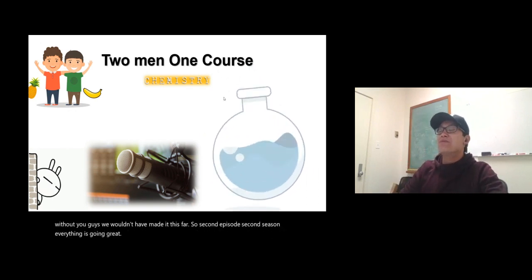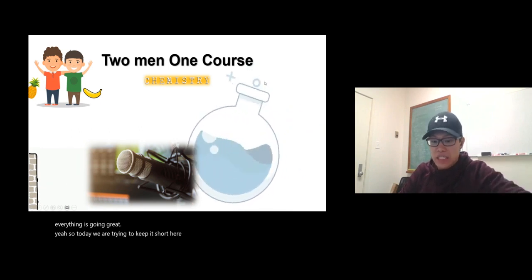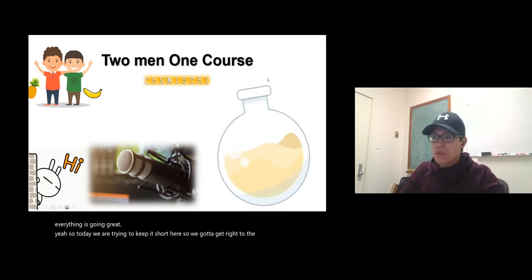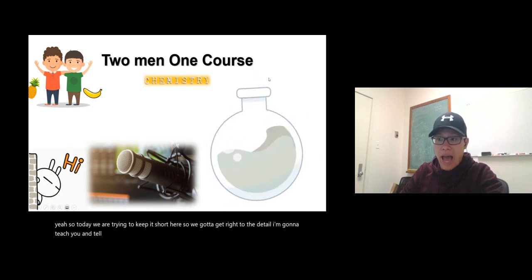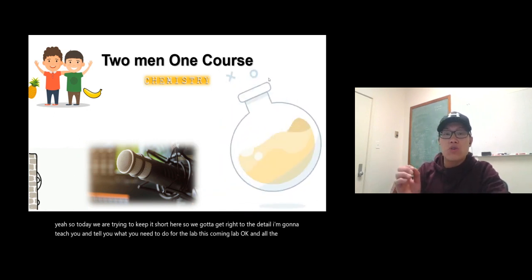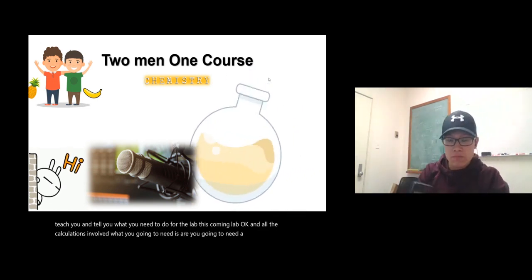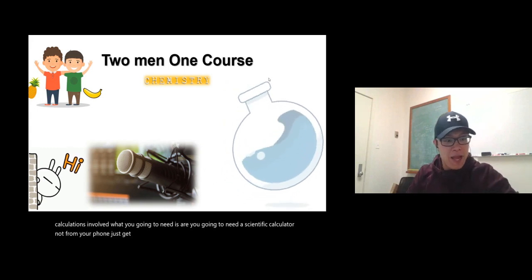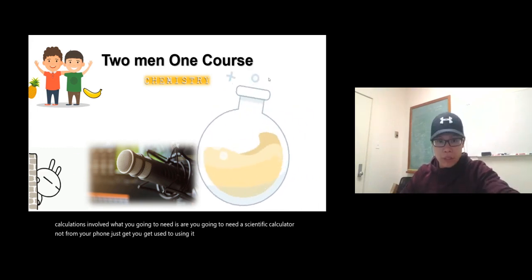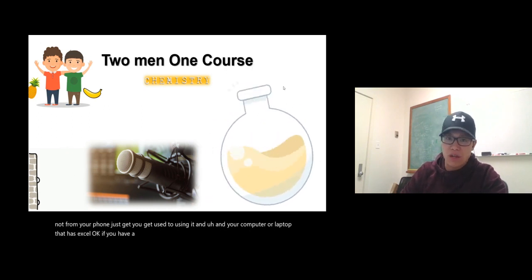So today we are trying to keep it short, so we're going to get right into the detail. I'm going to teach you and tell you what you need to do for this coming lab, and all the calculation involved. You're going to need a scientific calculator, not from your phone. Just get used to using it, and a laptop that has Excel. If you have a mouse, it will save you a lot of time.